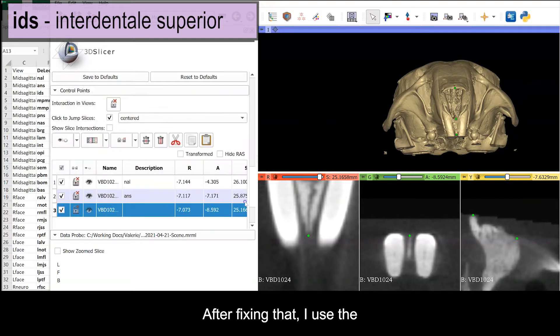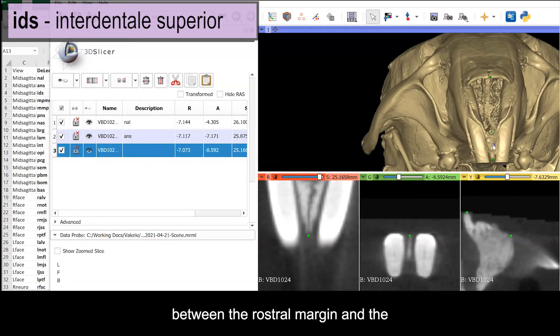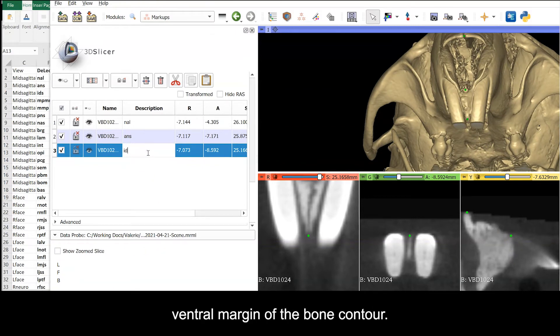After fixing that, I use the sagittal view to confirm the point is at the maximum of curvature between the rostral margin and the ventral margin of the bone contour.